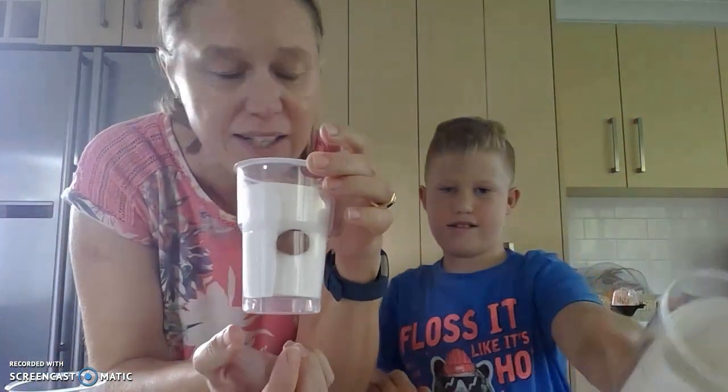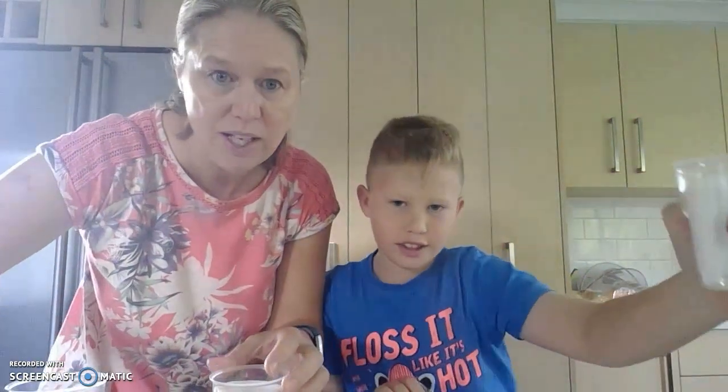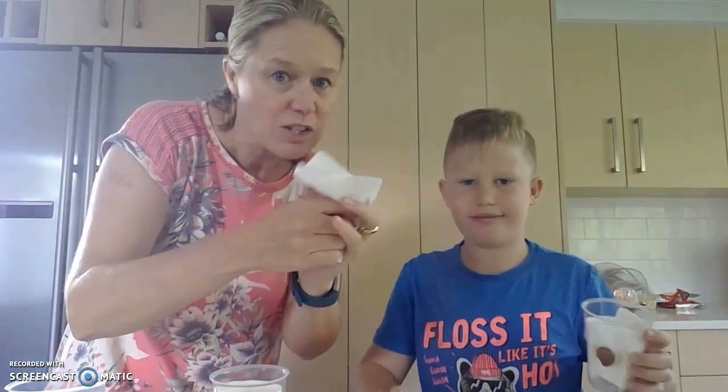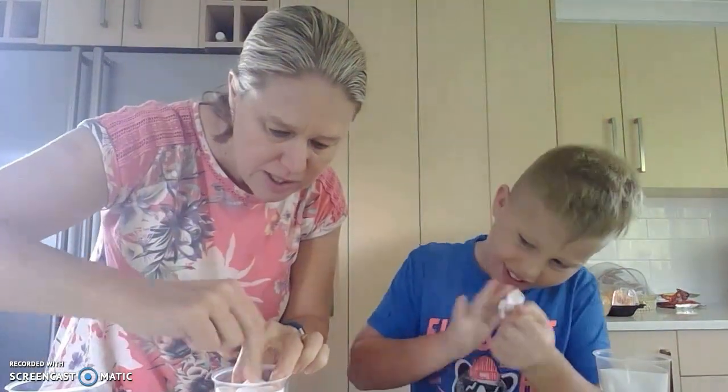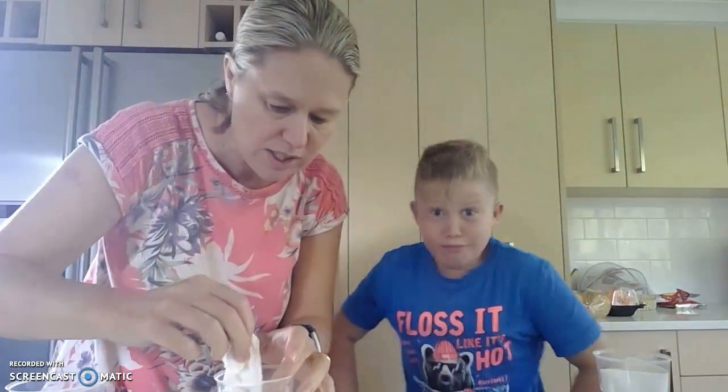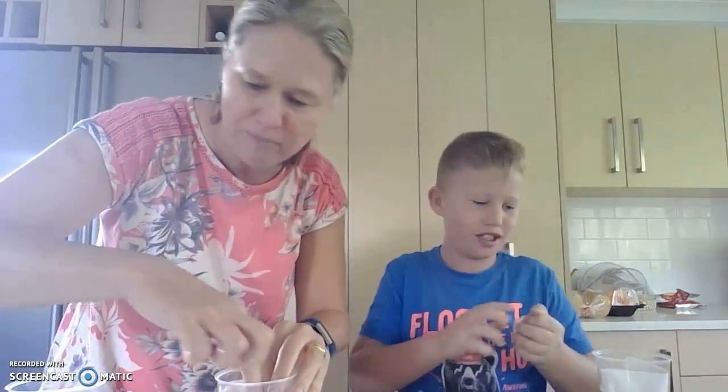So that one's got more of an upright position - that one's that way and that one's laid flat. Now we're going to take some paper towels - scrunch up your paper towels, Thomas - and we're going to put that inside just to fill the cup, because this is going to give the seeds their water supply. Put them in your cup.